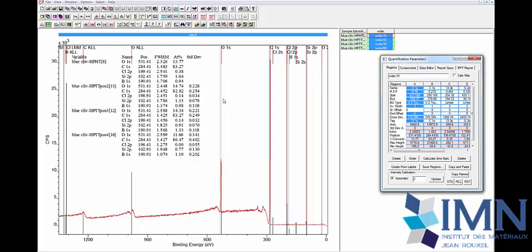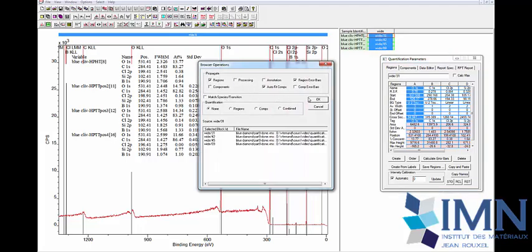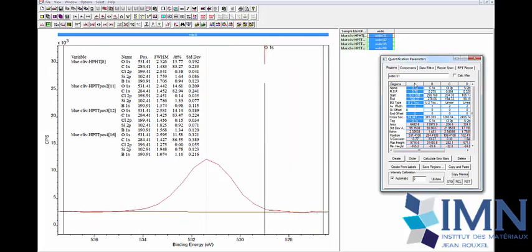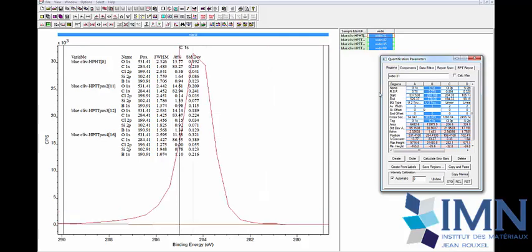You have to do it in a reasonable way. Sometimes you win, sometimes you don't win. But now we have reduced the uncertainty on oxygen. It means that, because everything is correlated, uncertainty on one element will induce uncertainty on the other one, so this will improve the general uncertainties.